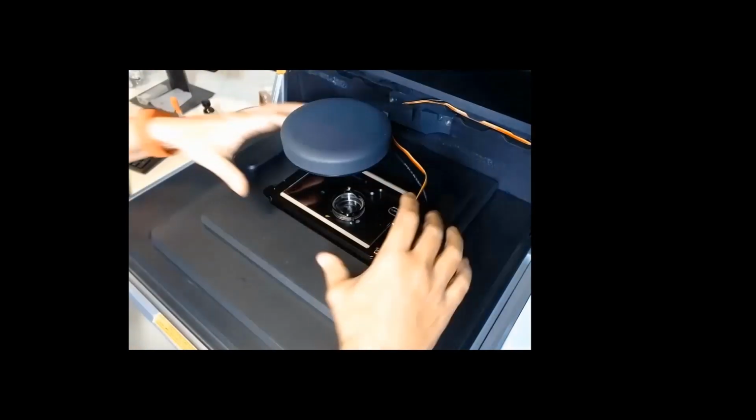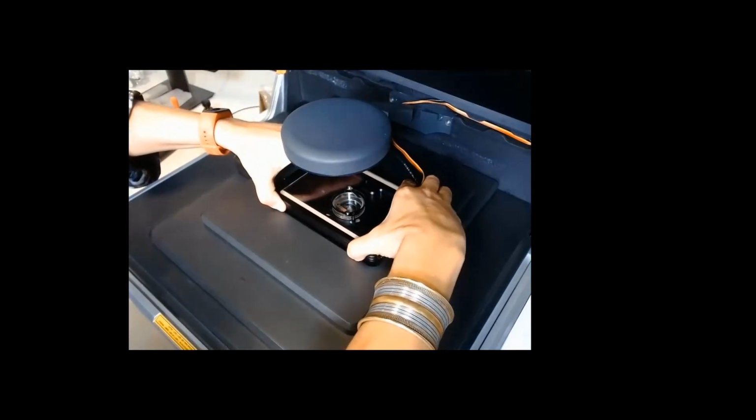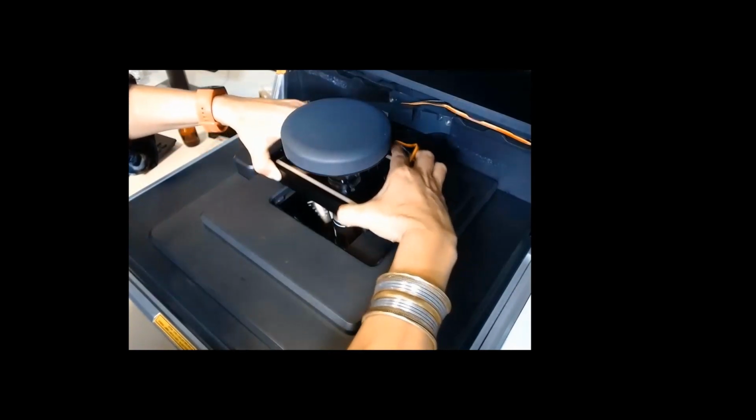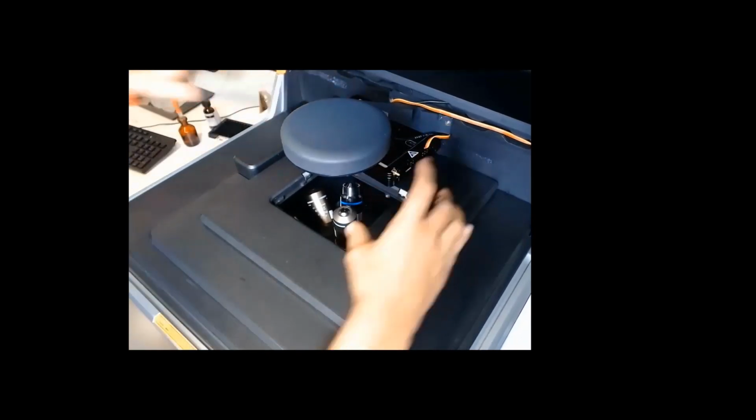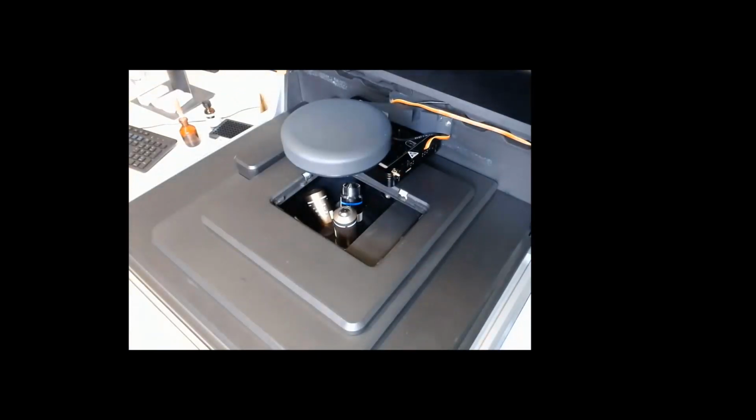And now we are going to move to an oil objective. To move to an oil objective, you have centered your sample where you wanted it to be. You remove the incubator and place it on the side. And on the Fusion software, you press that you want to move to an oil objective. The objective will escape Z and will move to the oil position.